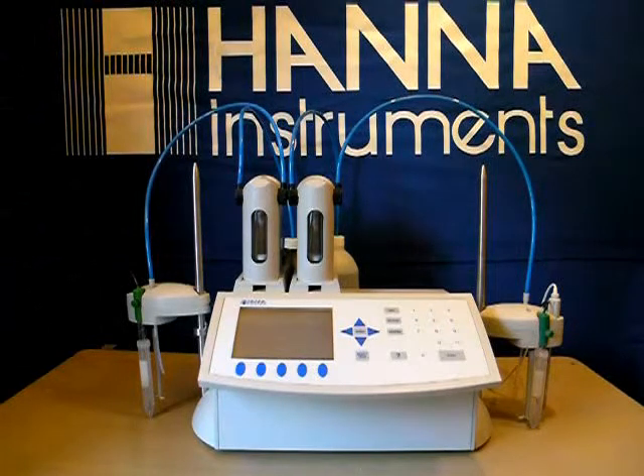Welcome to Hanna Instruments. Today we're going to be calibrating the pH probe on the Hanna 902C Color Auto Titrator.